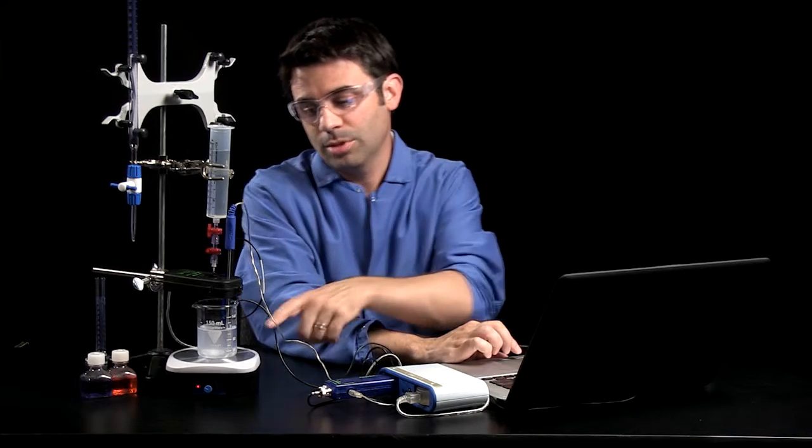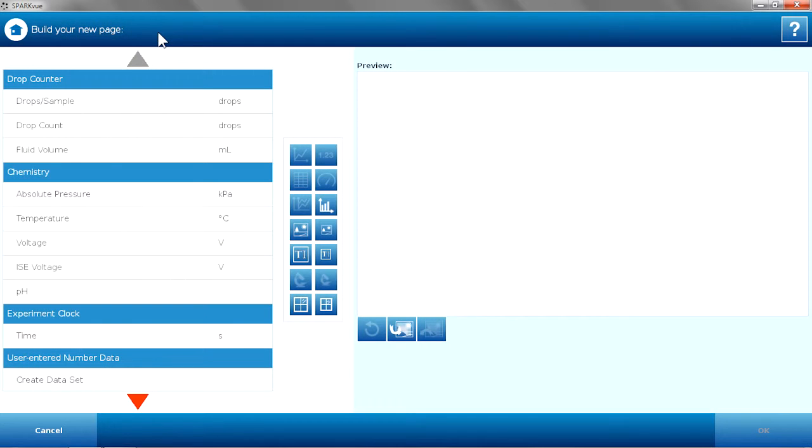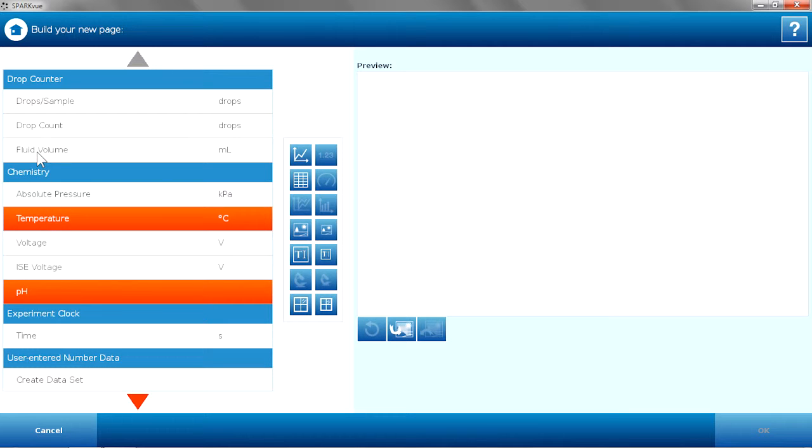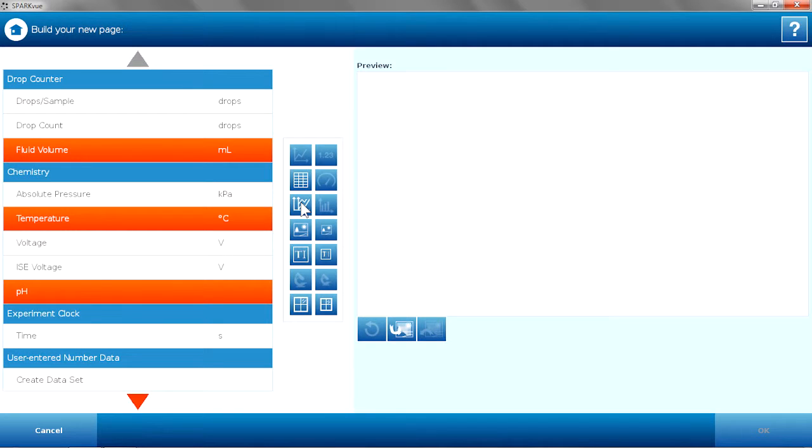Now I can go even further with this, because I did have the temperature probe, the stainless steel temperature probe in there. In this case, I'm going to plot my pH and temperature versus fluid volume, and just see what the data shows me. So again, using the multiple y-axis feature.